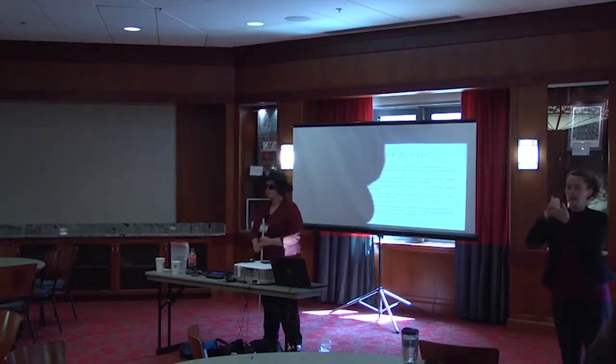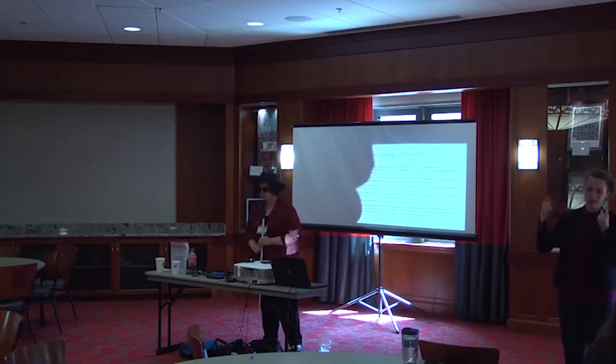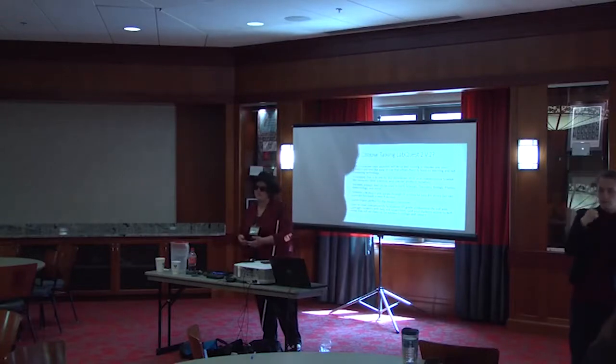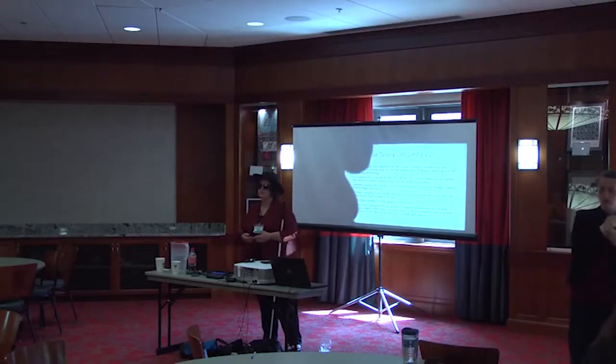A lot of times you just add some cheap Dymo Braille label tape, or a piece of tape with large print on there that says what your access code is going to be.